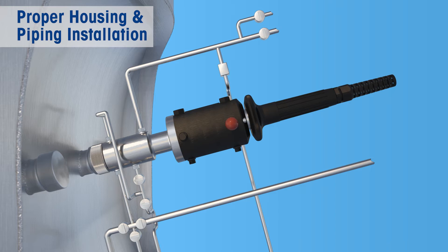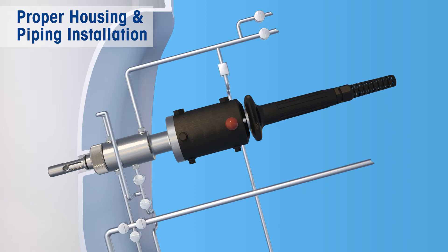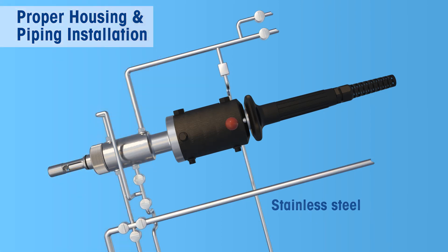The key to preventing cross-contamination is proper setup of both the housing and the piping. First, it is necessary to use the correct material for the piping. The piping should be of hygienic design using stainless steel of the same type as used for the housing to avoid corrosion, and the piping should be set up at an angle so that condensate can drain from the top to the bottom, preventing the condensate from being trapped inside the installation.